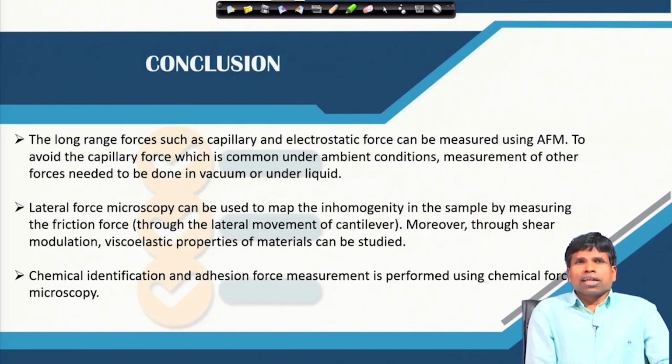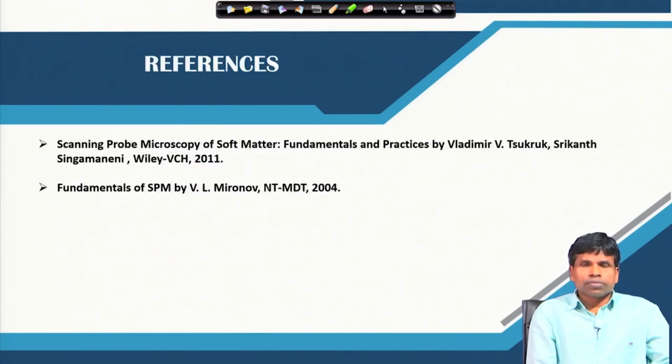And then we discussed lateral force microscopy and shear modulation force microscopy to study the viscoelastic properties of materials, particularly materials that have both viscous and elastic properties, particularly for polymeric samples. These are the references.